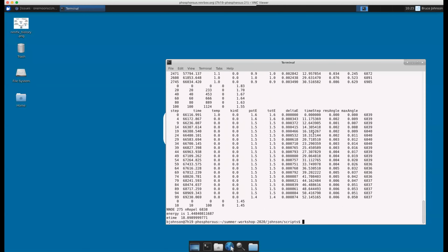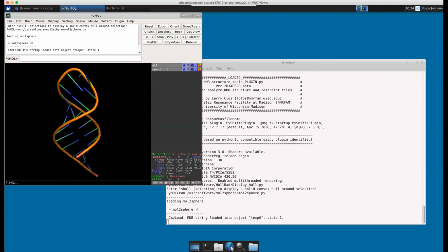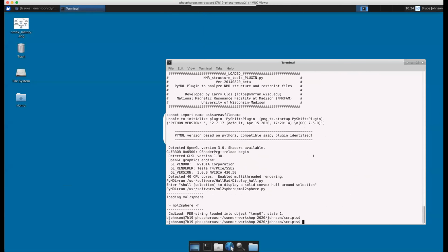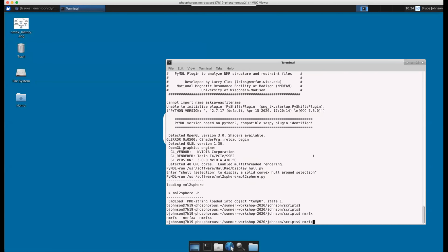a helix. And so that's run, and I can do pymol output. It will put one file in the output directory, and boom, there we folded up and made a nice little stem turn RNA. So those are the 3 programs that you may use for doing this: nmrfx, the GUI program, A, the command line processing program, and S, the structure calculation program, which does a variety of other things like chemical shift prediction, etc.